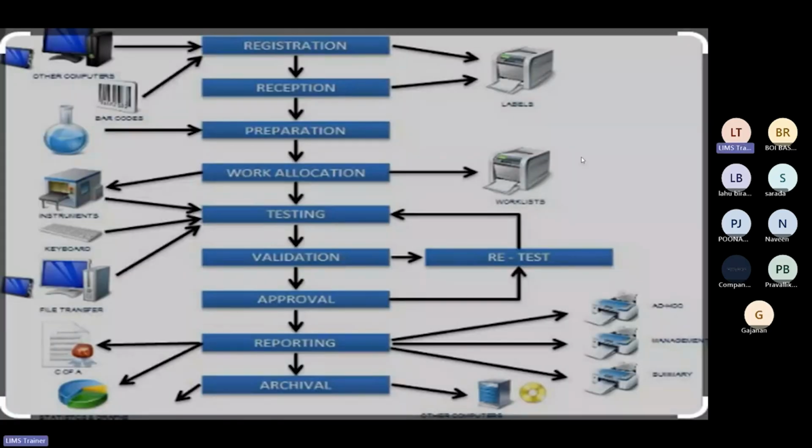Here you can see, starting from reception, preparation, work allocation, testing, validation, approval, reporting, how the data is archived, or if a retest is required for some samples, all these things are involved, and all this is controlled by the software. That also I'm going to explain to you in detail.